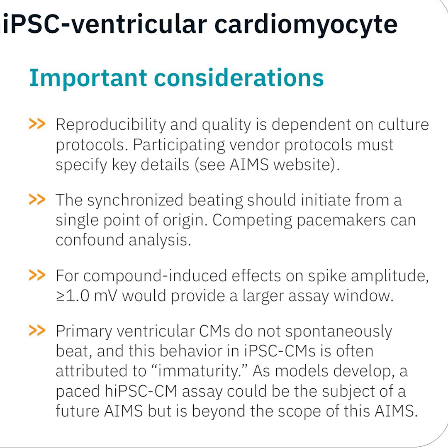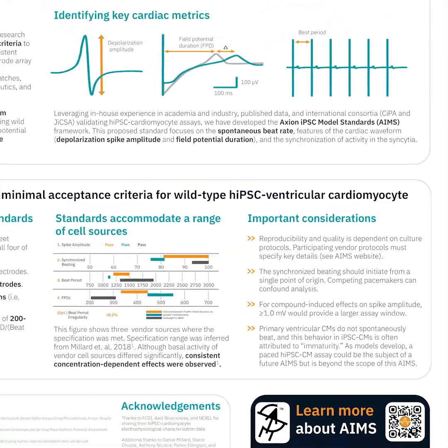MEA recording, the equilibration time given between docking the MEA plate and the start of the recording, the experimental window, that is, the specific time frame within which the iPSC cardiomyocytes will perform as claimed, and recommended appropriate positive and negative controls for the response of interest, with expected responses detailed for the former. For example, application of the hERG potassium channel blocker E4031 at 100 nanomolar should result in a greater than or equal to 20% increase in the corrected field potential duration.